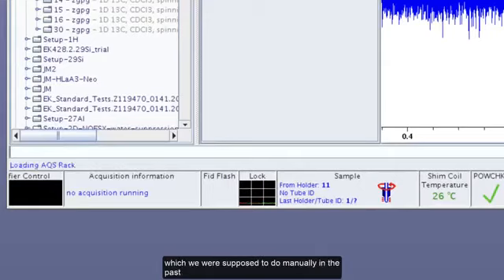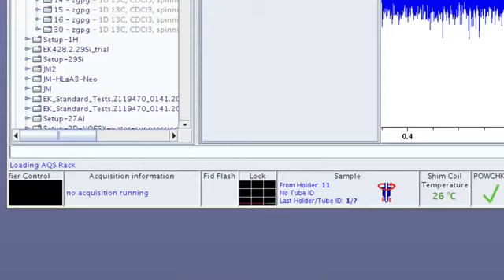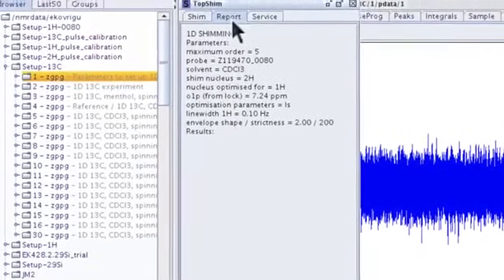DUX, a critical electronic switch inside the probe that protects the sensitive receiver from the powerful transmitted pulses. Preamplifier, preamp, located very close to the probe, it receives the extremely weak NMR signal, microvolts, from the probe and provides the first stage of amplification with minimal added noise, crucial for sensitivity. Receiver, RCU, further processes the signal from the preamp, including filtering and conversion from an analog voltage to a digital number, analog to digital converter, ADC.